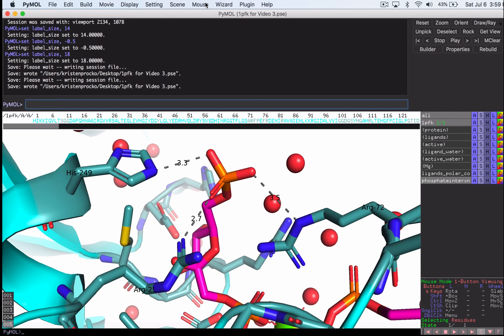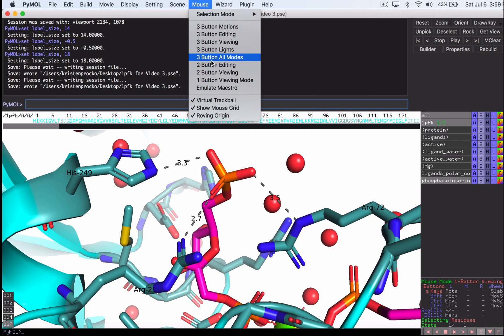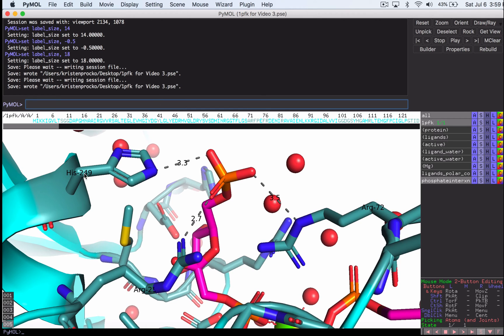But I'm using my trackpad, so I'm going to change my mouse now to a two button editing mode. And then I'm going to press on my Mac, it's command and click. I'm going to very carefully select this histidine and move it over here. Pressing command again and moving this label. So I'm just going to very carefully move these off. And hopefully I don't click on the residue atoms themselves because you can mess up your structure. And I think it's permanent. I don't know if you have any insight on this, leave me a comment.